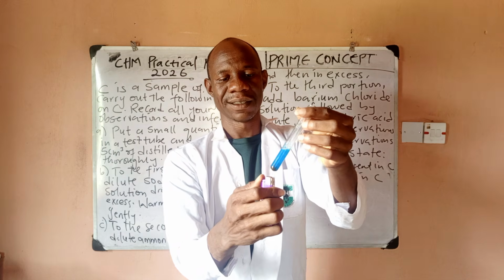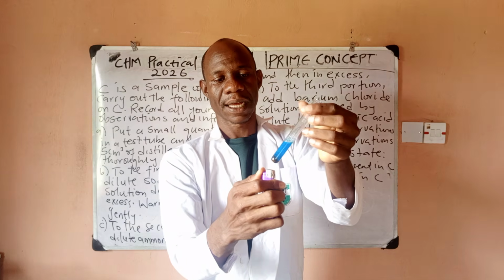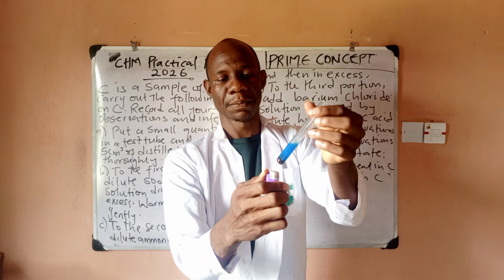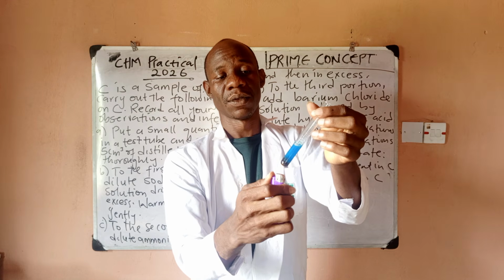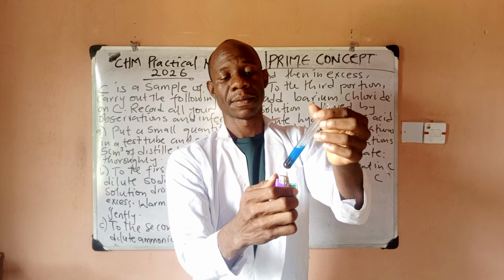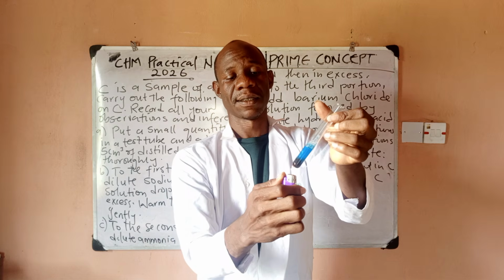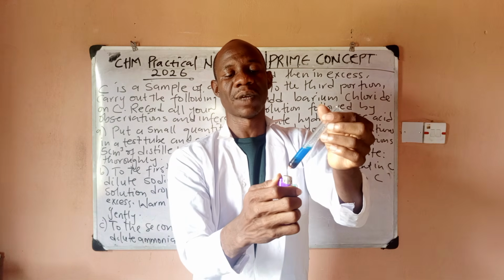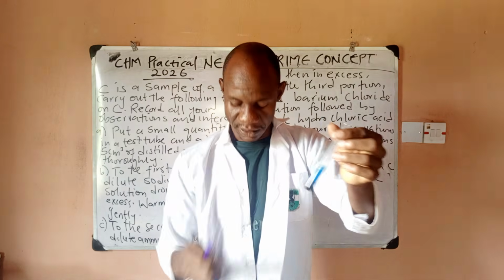What are you noticing? It is very obvious already. It's turning black. That precipitate is turning black. And if I keep heating this over a long time, you notice eventually that everything becomes what? Black. Yes. Can you see it? It's beautiful to do experiments and see clear observations. Yes, I think I'll stop.